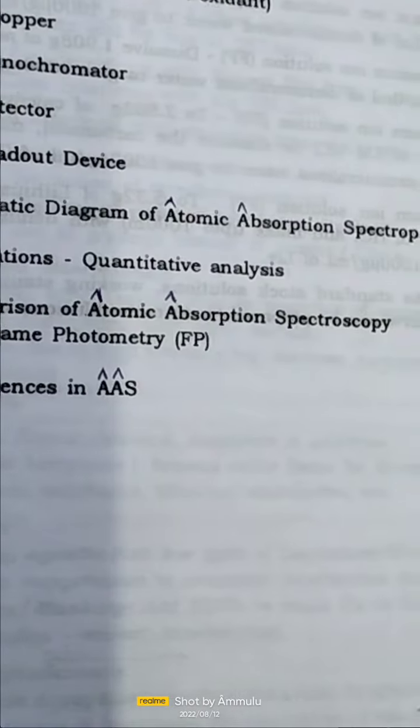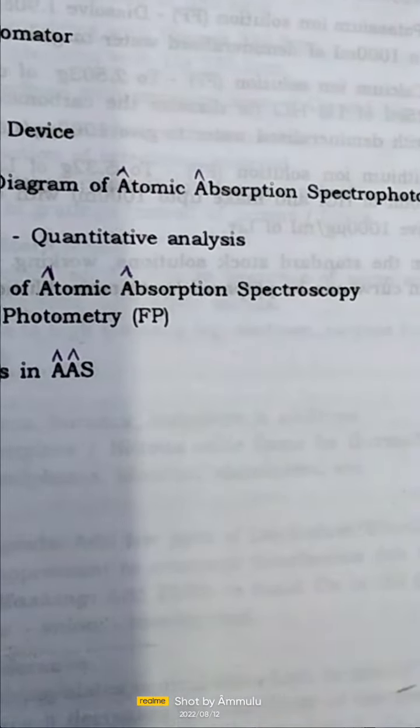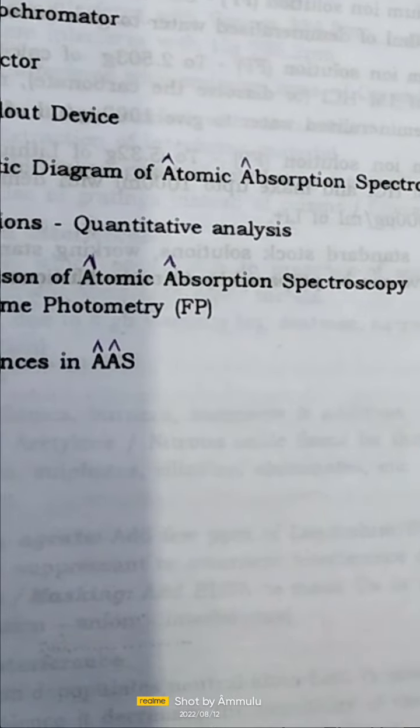The principle of atomic absorption spectroscopy is that when a solution of metallic salt is sprayed onto a flame, fine droplets are formed.